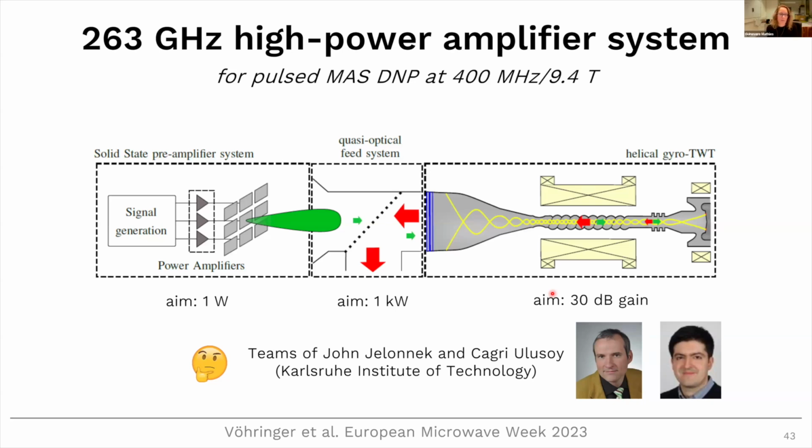I am not sure if there are many other leading candidates. I mean, there is, of course, the structure that was developed also in the Temkin lab, you probably know, where they had a photonic bandgap interaction structure at 250 gigahertz. So I think when it comes to these gyro amplifiers, it really comes down to what kind of interaction structure you design, how easily you can manufacture it, which I think is very important, and then how stable it is in use. But there are not that many.